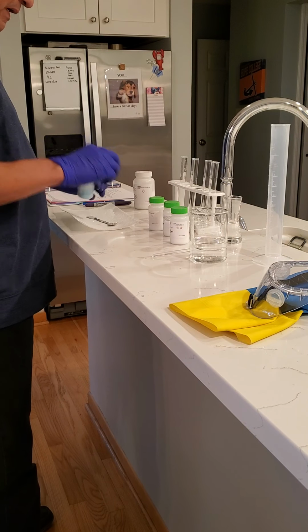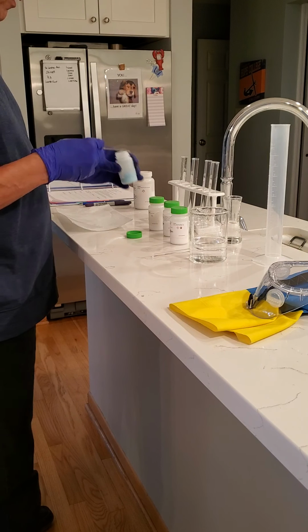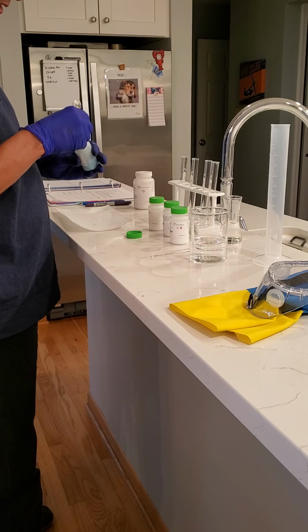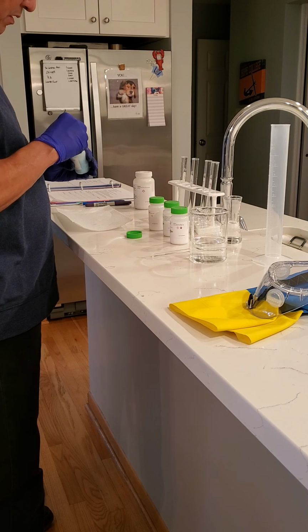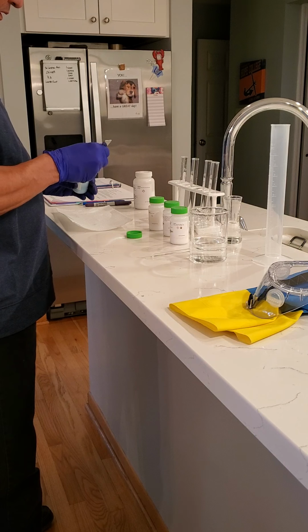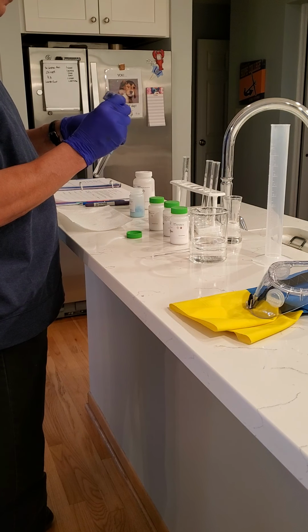Next one is going to be the copper sulfate. So we'll take our spatula, and remember we're working with copper sulfate before, and we know that its solubility is already limited, just based on the experiments we've done in the past with this. So take some small chunks if you can find them, about half a spoonful, and we'll add that to number 2 test tube. Just like that.